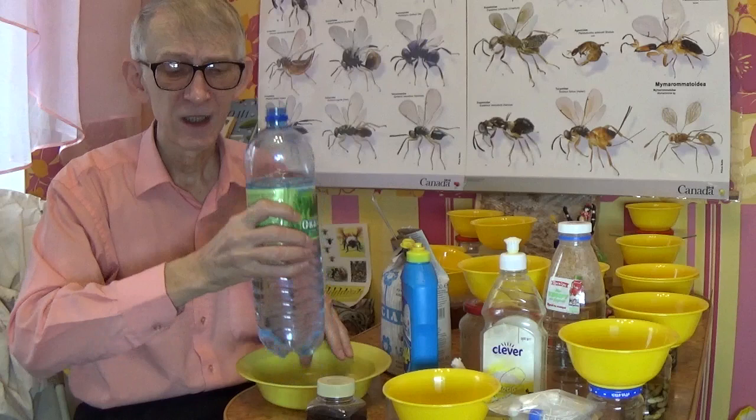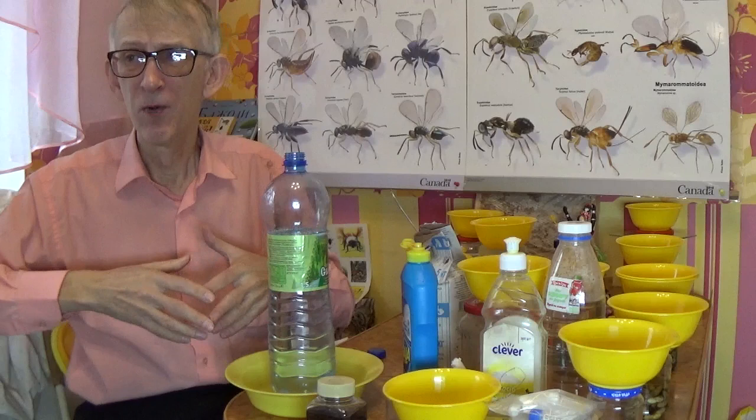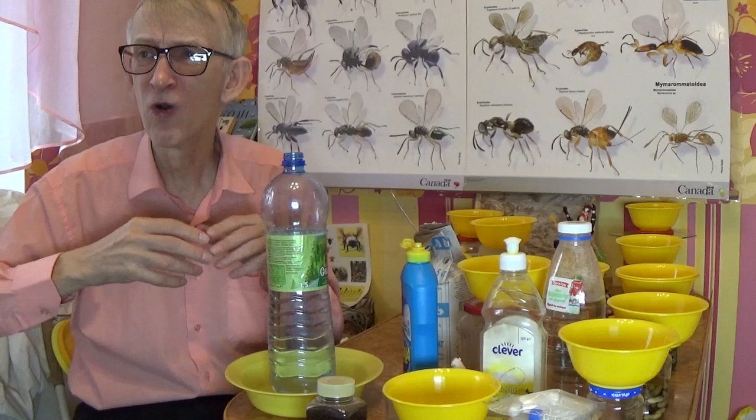When the weather is hot, the water inside will heat up during the daytime, causing insects to start rotting — their bodies swell and they can be partially or fully destroyed. After one or two days without preservation, the material will be in poor condition, partially or completely destroyed.